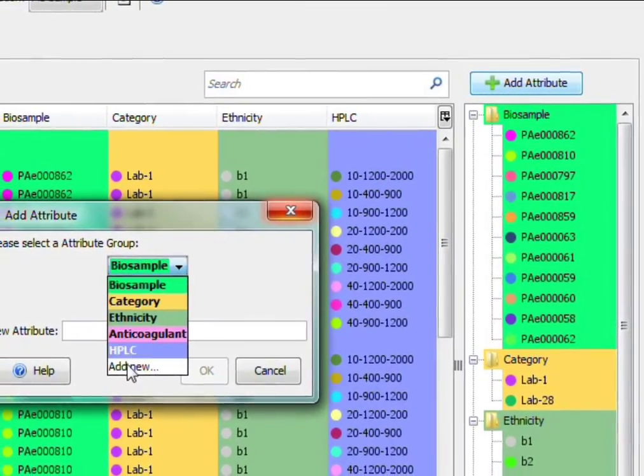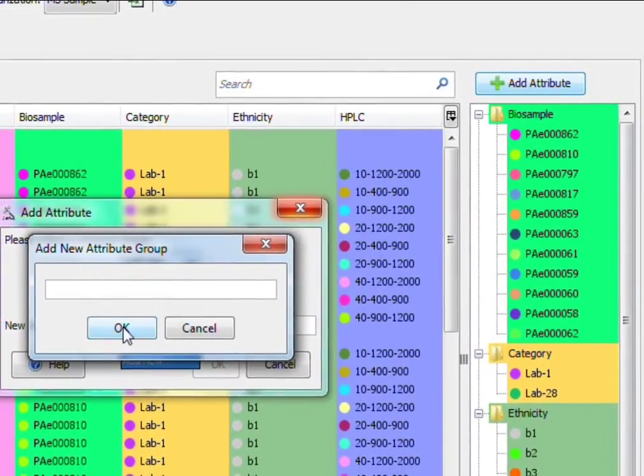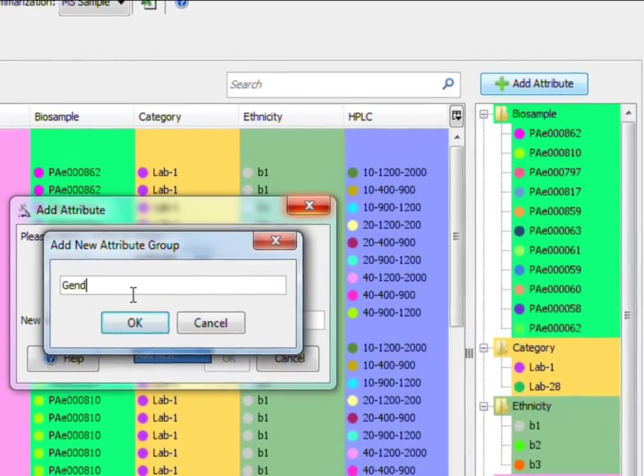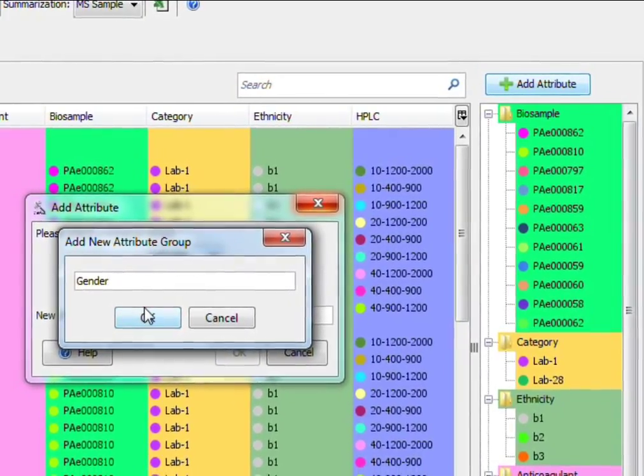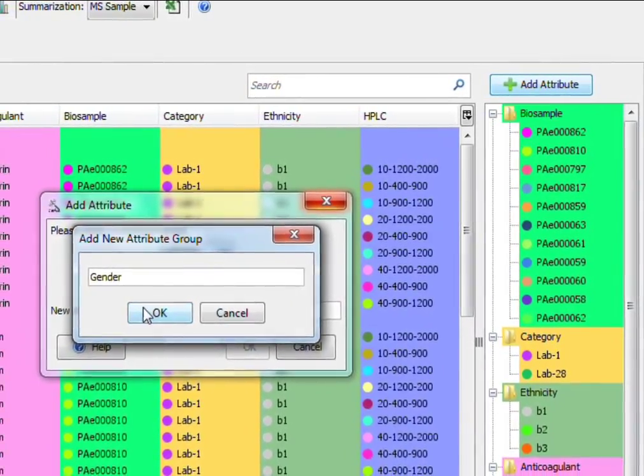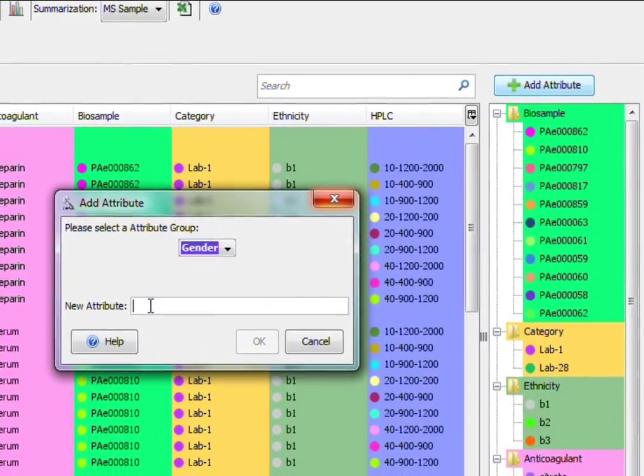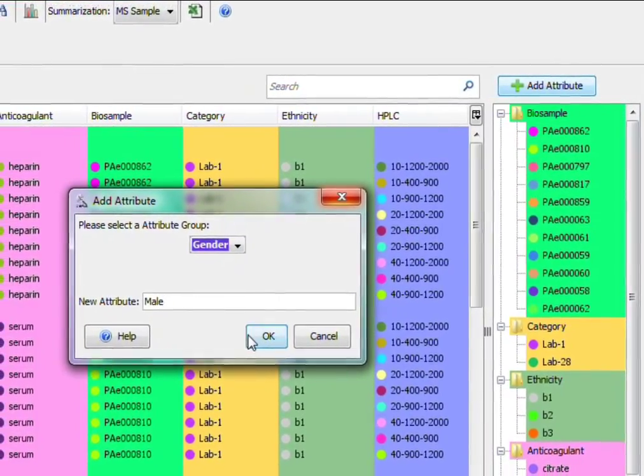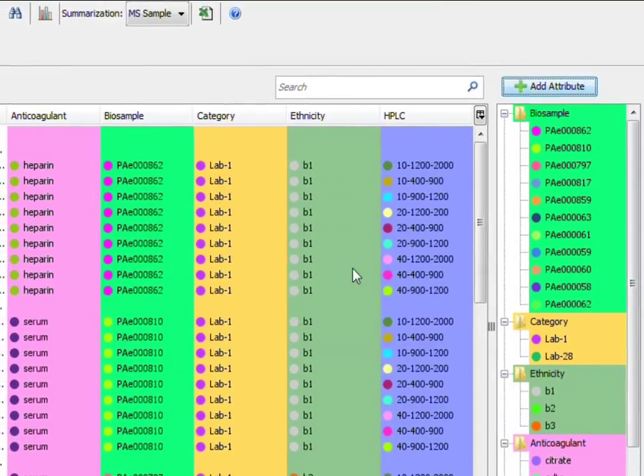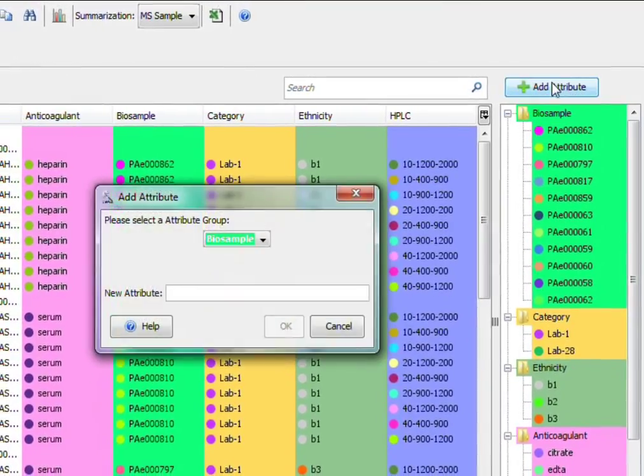We know that not all MS-MS samples are created equally. That's why we've built an organized view that lets you define the attributes of each loaded sample.